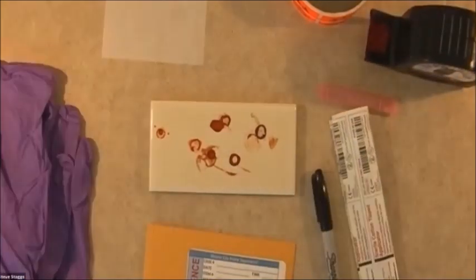So what we're going to do is first of all collect the blood stain. Now this is a dried blood stain, so what we're going to have to do is moisten a tip and then do the packaging.